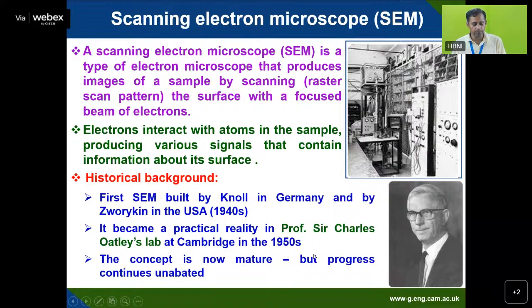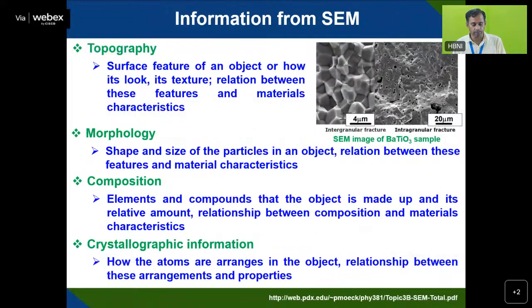So then the concept is now mature. From 1950 to today, a lot of progress has been made, and we are able to see very good resolution images, at very high magnification, as well as good quality images by scanning electron microscope.